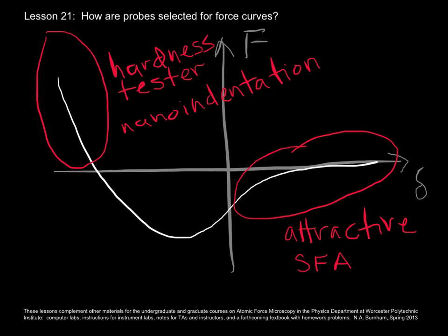And then more recently, starting about the 80s, nano-indentation, where you monitor the force and the indentation depth instead of just one force and looking at the resulting area.